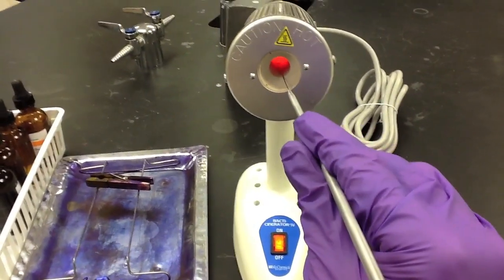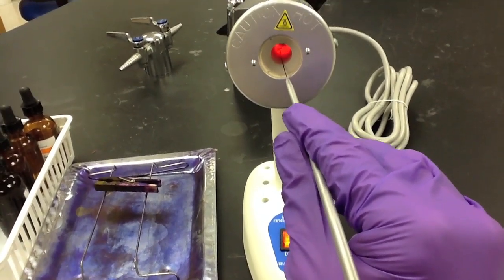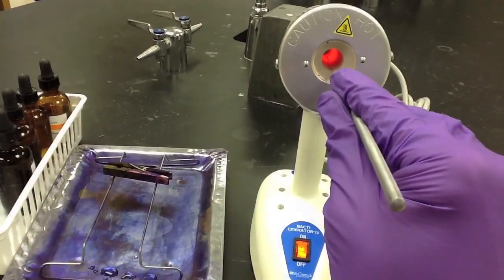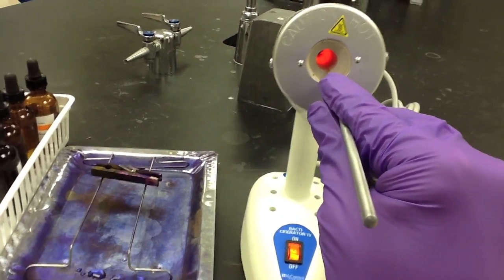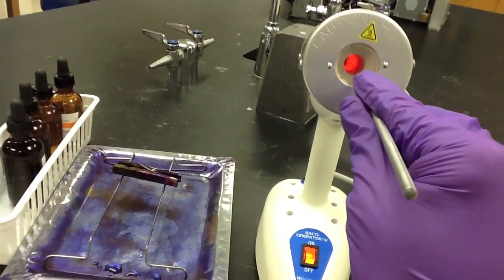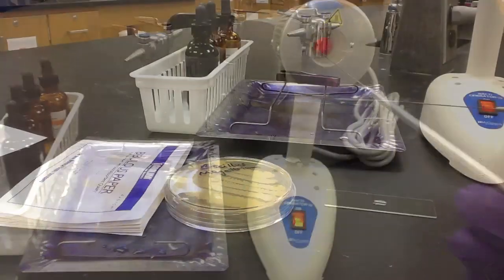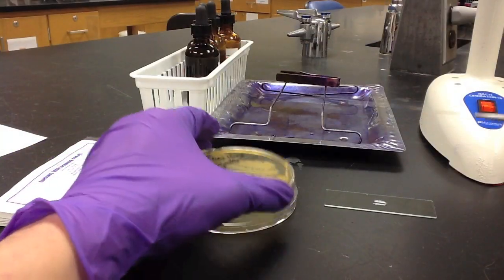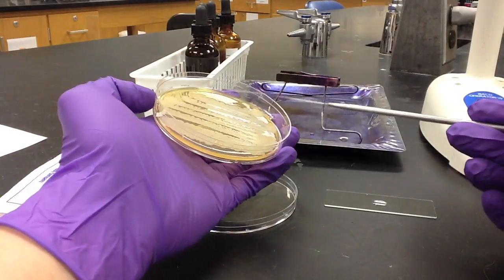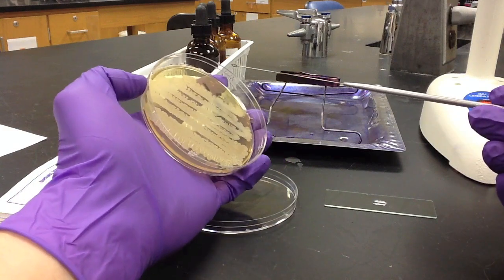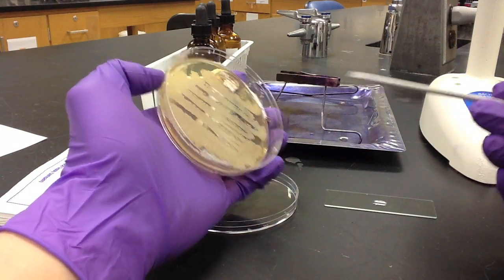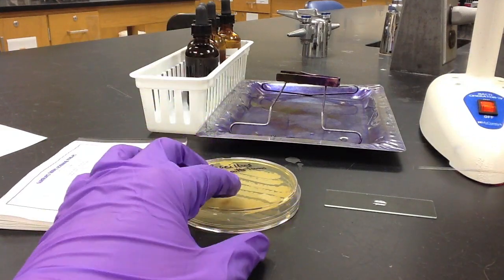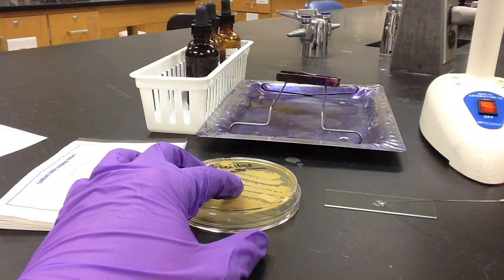We then place our inoculating loop into the incinerator to sterilize it. Once it reaches the appropriate temperature and is glowing orange, we remove it. Before coming into contact with the cells, we must first cool the loop by touching a blank piece of agar. We can then come into contact with the cells once the loop is cool, and after we've picked our cells, we'll spread them and disperse them in the droplet of water.